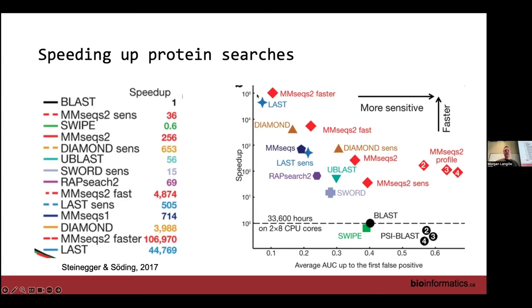So this is an important concept. Obviously, one gene can be mapped to multiple modules or pathways. You also get interesting information about how these pathways can then get mapped into larger systems that are a bit more general. And so you can keep collapsing them up to get to some general category, including something as general as carbohydrate metabolism, right?